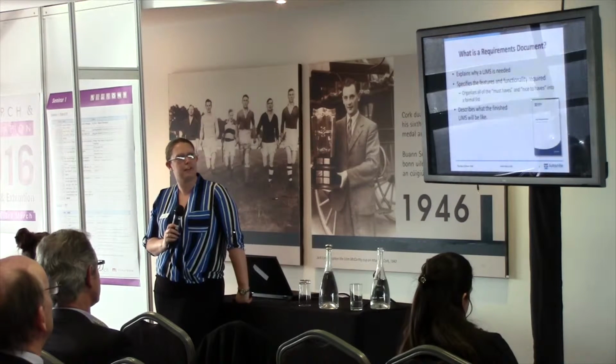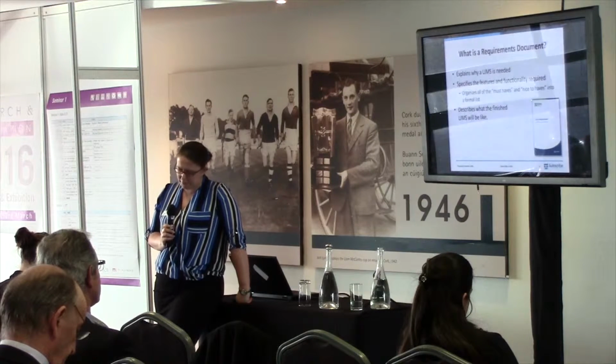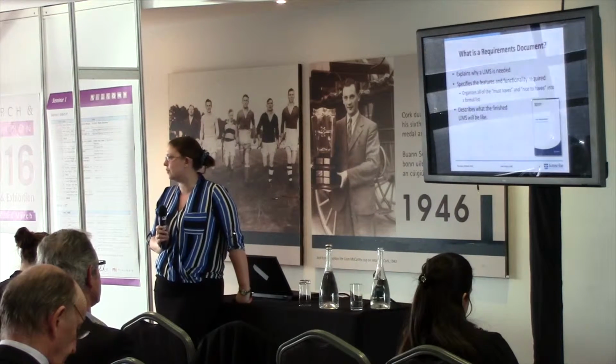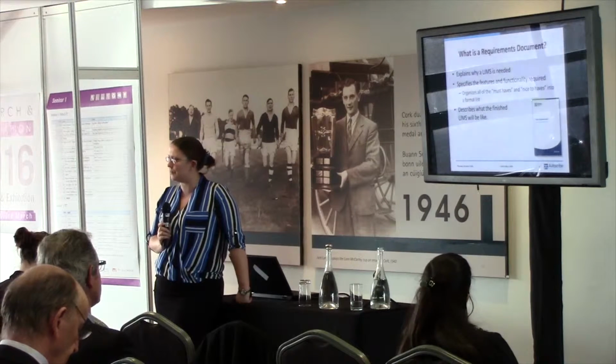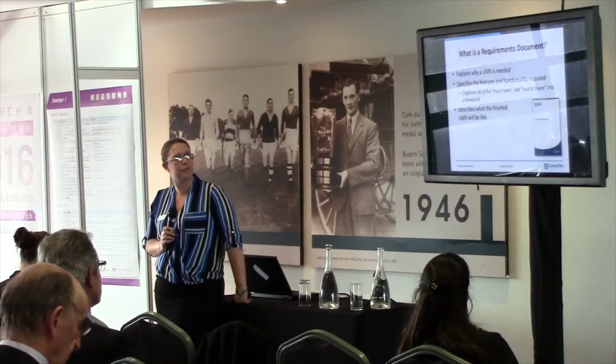It's explaining the features and the functionality that you require in your specific lab. Now, I could talk about LIMS, I could talk about business information management systems. It doesn't really matter. We need to know the details of what you want the software to do.